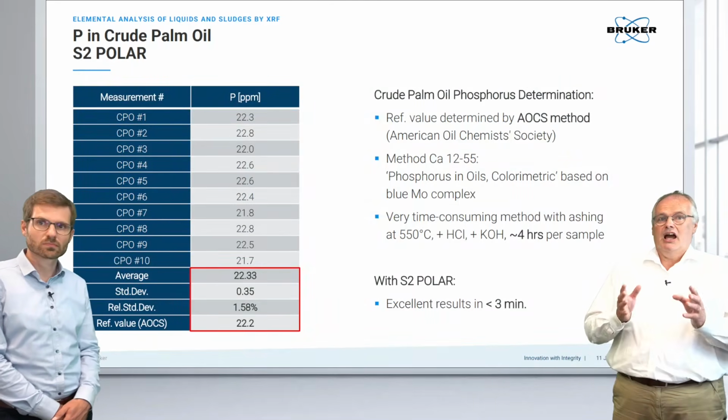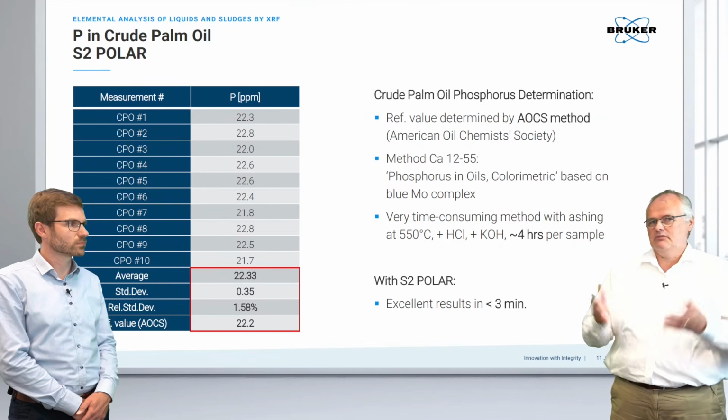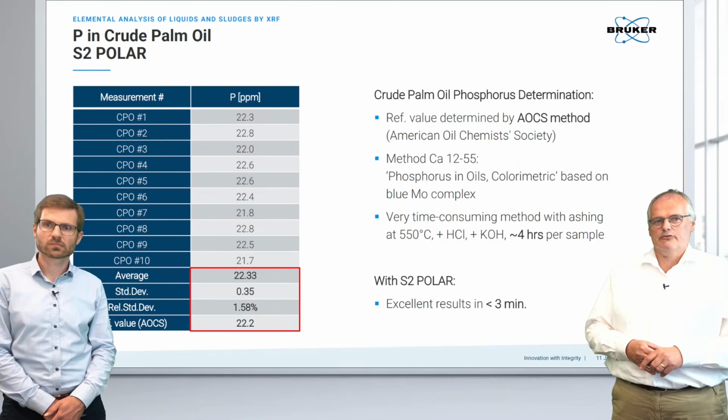Yeah. When we compare, and that's the most obvious benefit of using XRF for edible oils, here palm oils, we have a result within 3 minutes.